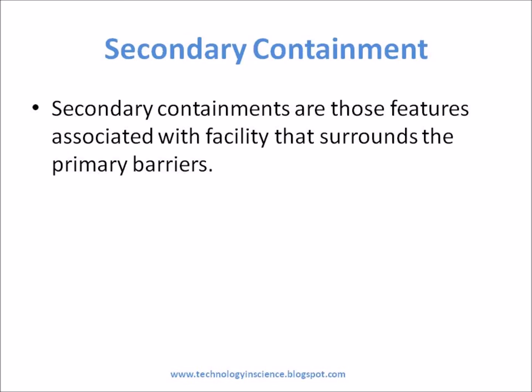Secondary Containment. Secondary containments are those features associated with the facility that surrounds the primary barriers. Examples include floors, walls, and ceilings, air locks, self-closing doors, differential pressure between spaces, exhaust filtration, as well as treating contaminated air, liquid, and solids. The function of secondary containment is to prevent both the release of microbes into the environment and to prevent contaminated organisms from contaminating the workplace.